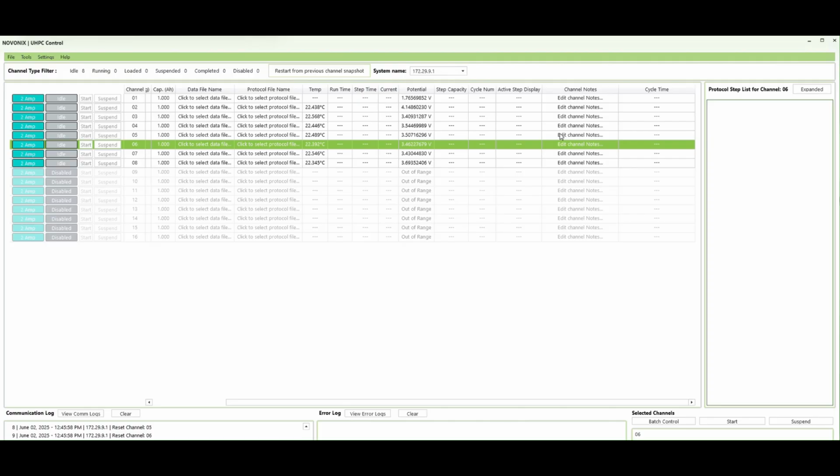Today we're going to be walking you through editing and resetting the column configuration in UHPC Control, as well as discussing a few other features in UHPC Control that you may not be familiar with. So let's get started.